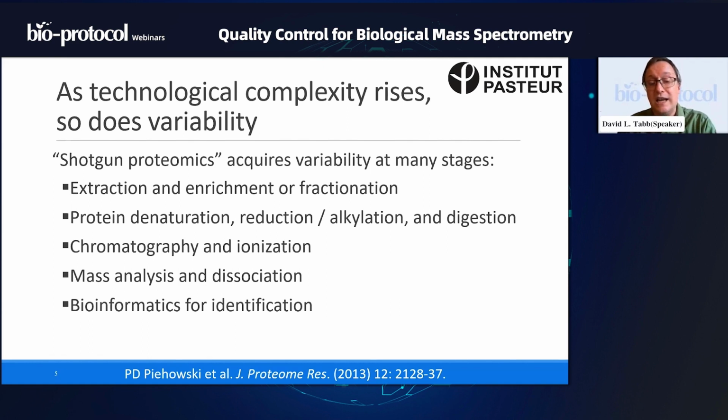So let's consider this in the case of shotgun proteomics. We already talked about the processes of extraction, where we try to get the proteins out of cells. Perhaps we've used something like enrichment. Maybe we were interested in phosphopeptides, so we used a column to enrich for phosphopeptides. We maybe used fractionation for a very complex proteome. All of those different processes can bring variability along with them. And even if you started with exactly the same blob of cells, the proteins that come out will differ if you extract this aliquot and then do another aliquot differently. Even if you try to follow the same steps as identically as possible, variability will still creep in.